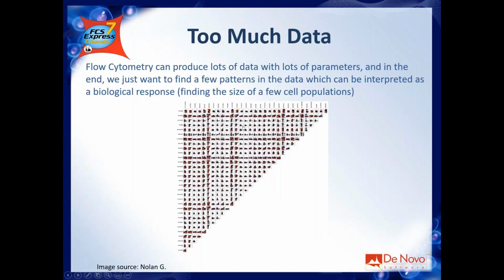So why do we need clustering, and generally speaking, why do we need high-dimensional data analysis tools? Because nowadays, flow cytometry, but I would also include mass cytometry and definitely image cytometry, generate data with a lot of parameters, a lot of features, so a lot of dimensions. The standard way to analyze this type of data, by which I mean opening multiple two-dimension plots, is not really efficient. It's time consuming anyway. What can you retrieve from an example like this with 200 different plots?